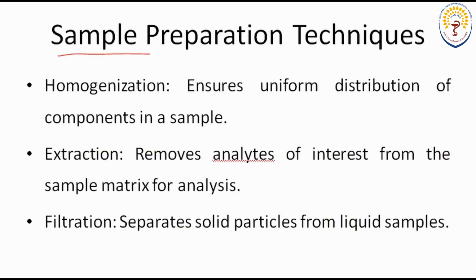Now, how will you prepare the sample? Previously you have studied how you will take the sample. Now when you have taken the sample, how will you prepare it so that it can be subjected to analysis? This is a very important thing, that sometimes a sample cannot be taken as a raw material directly. You first have to convert it into something else, or convert it into a suitable physical form. Then only you can do the analysis process.